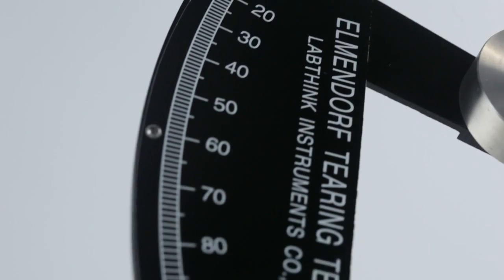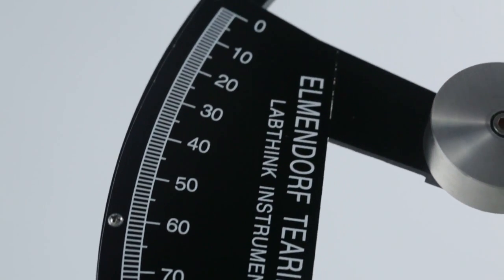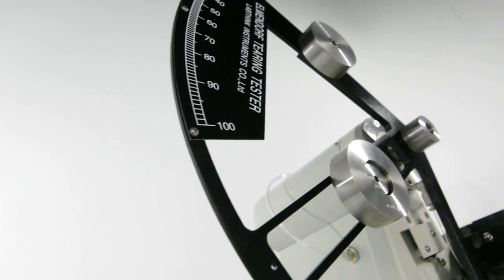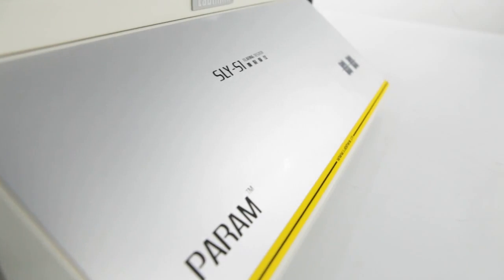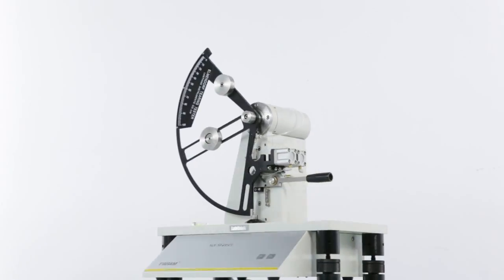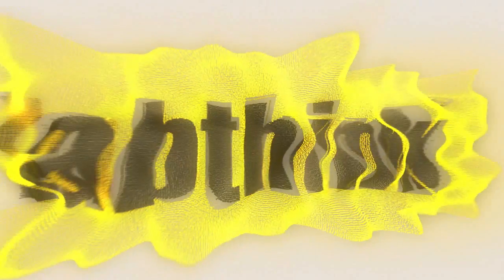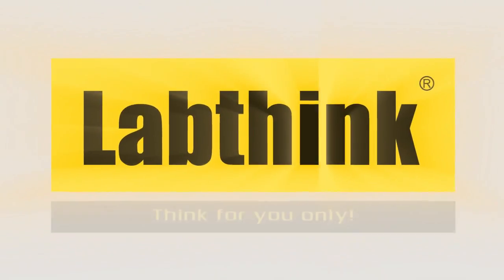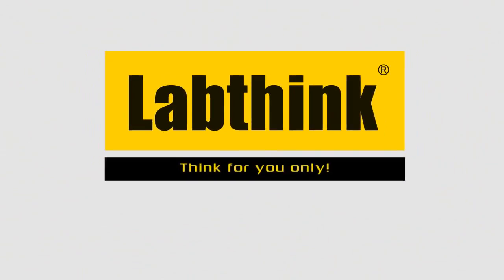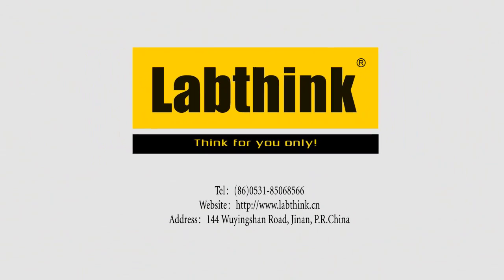SLY-S1, your excellent choice for high-accuracy tearing testers.